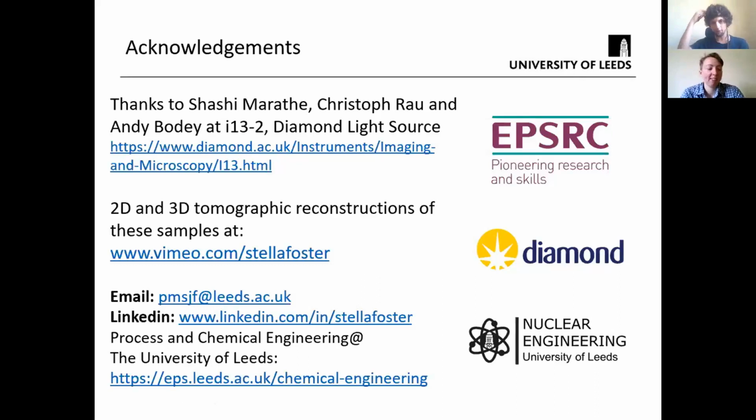Okay. Did you validate the results with another method of measurement? Right. Yes, I did. I didn't present that because, with the way lockdown is at the moment, I'm unable to access the computer we have at Leeds, which is physically located in Leeds. I can't access that remotely. But using the same data set, I did a slightly different image analysis with an open source machine learning program called Ilastik, spelt with an I-L, not E-L.